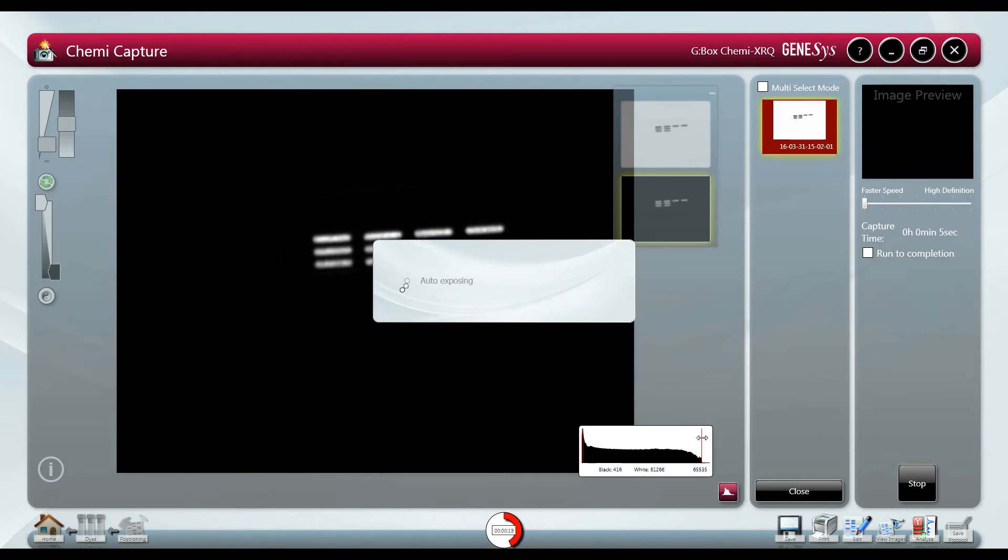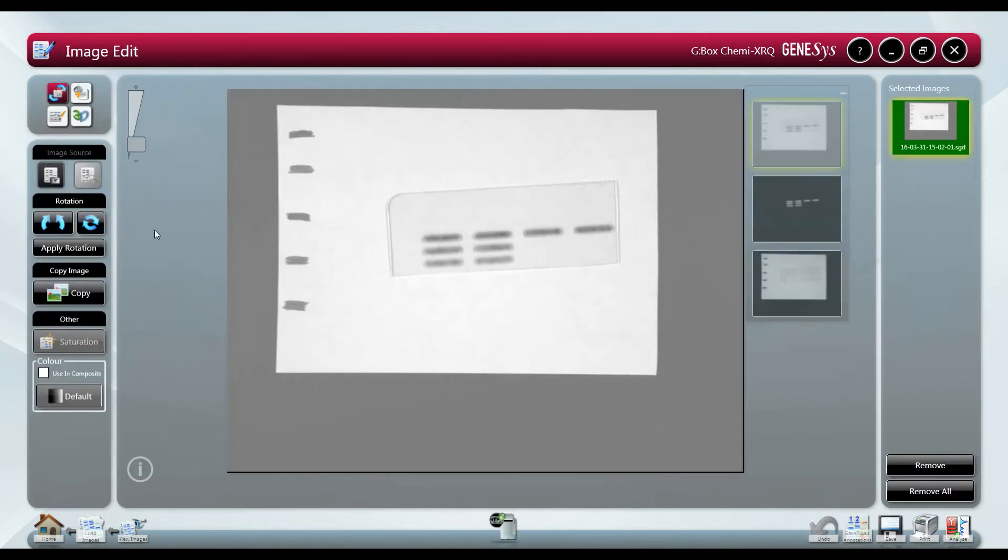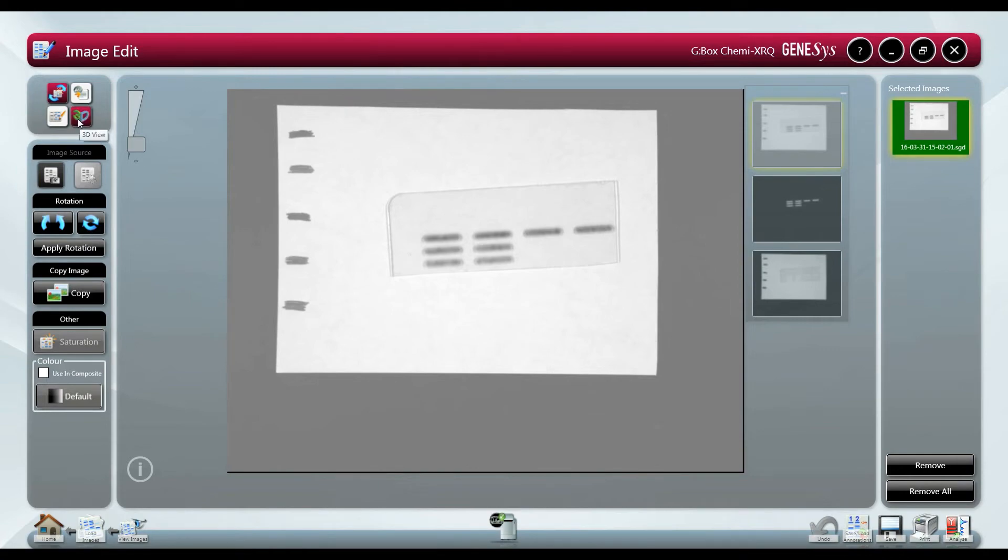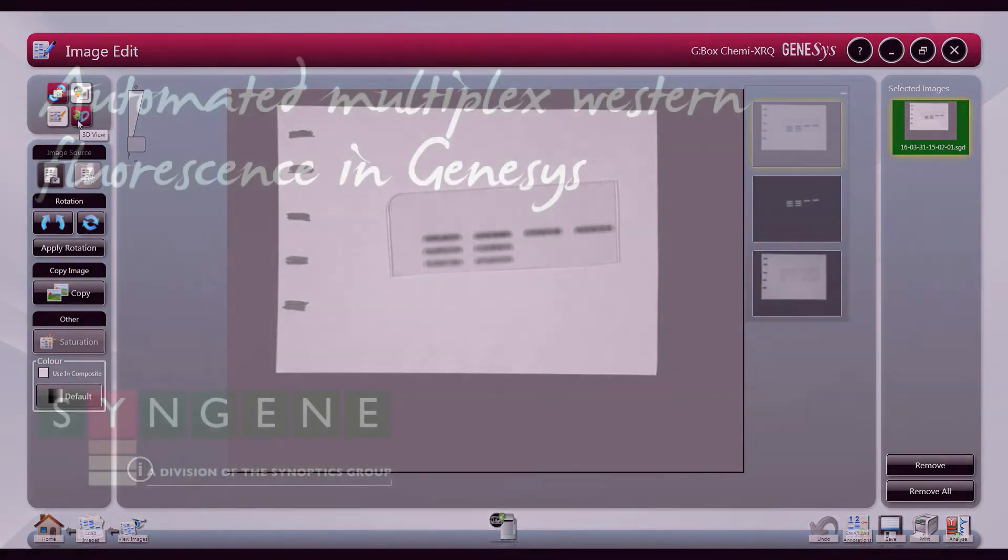The histogram shows the level of gray scales captured with the maximum number available at 65,500. We can also add annotations to the image and directly export to gene tools for quick and simple quantification of your blot.